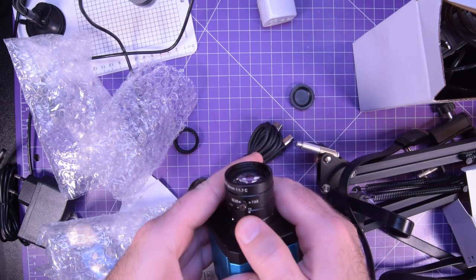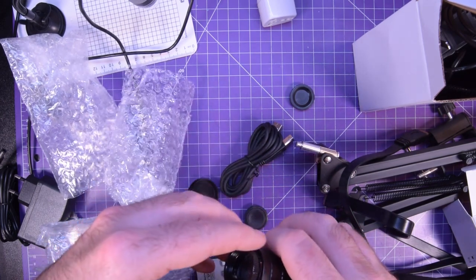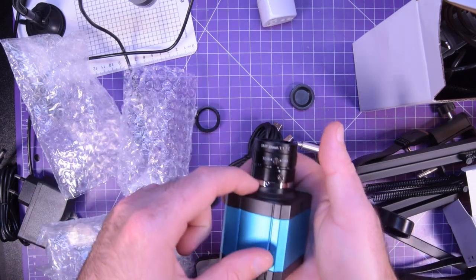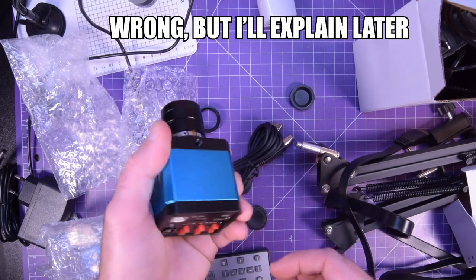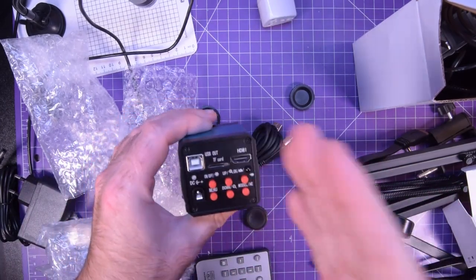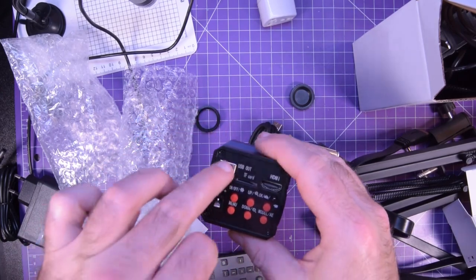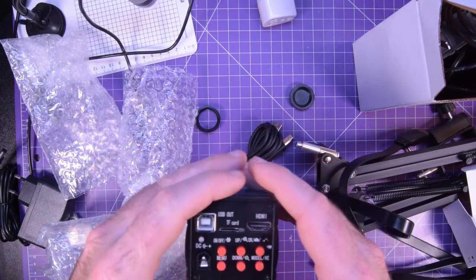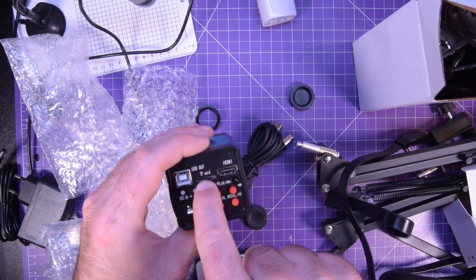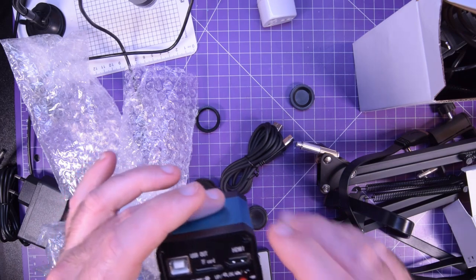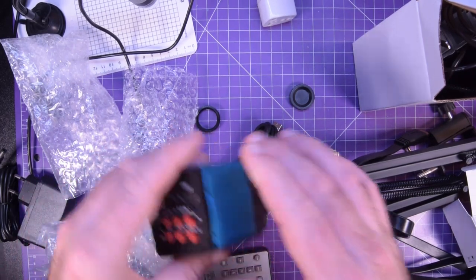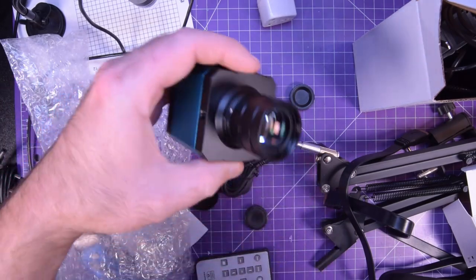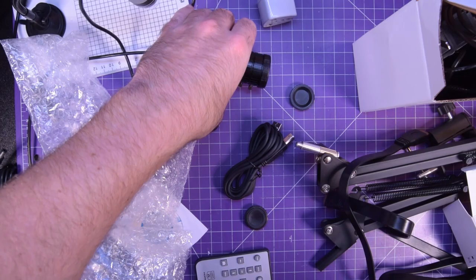So there we go. That is, that's actually really sweet. And you've got an adapter here. And I feel like that adapter is if the threads here on this camera are not the right threads. So this thing should be able to do 1080p 30, 30 frames per second through the USB. And it should be able to do 1080p 60 frames per second on the TF card recording and via the HDMI. So if you have a capture card, the HDMI might be a better option for you. That's neat. I can't wait to play with that.